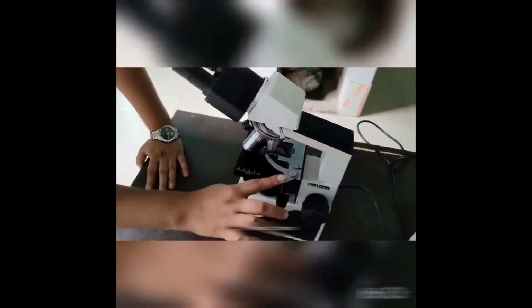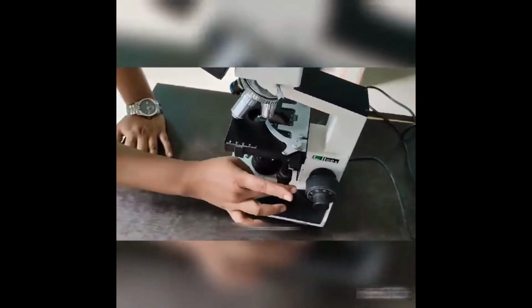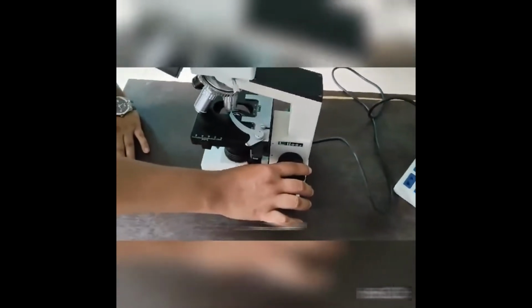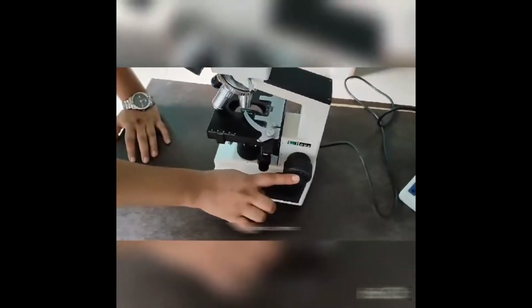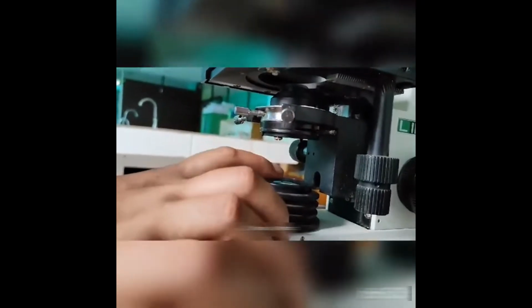This is the clip, and this is the knob, which is the stage controller, and the other is the clip controller, and this is the fine, coarse, and this is the fine adjustment, and this is the coarse adjustment.